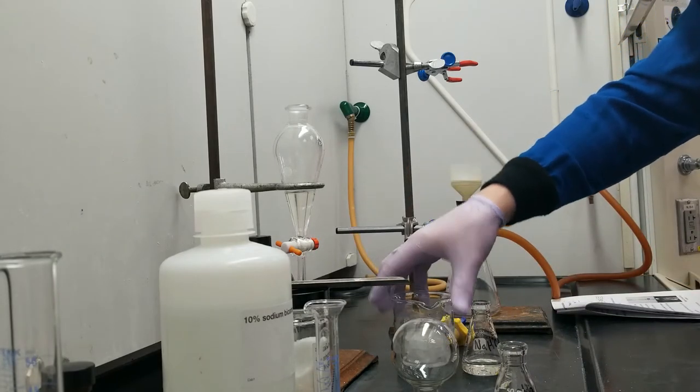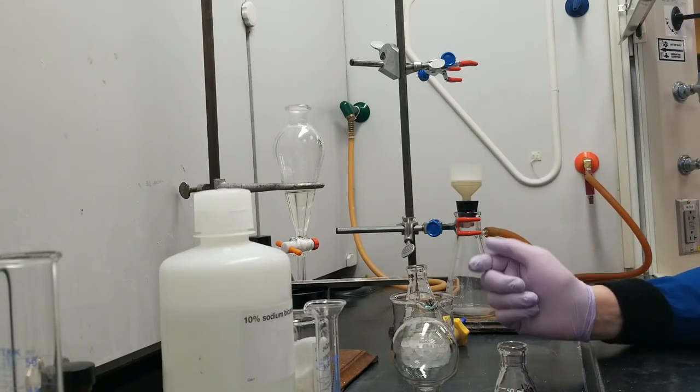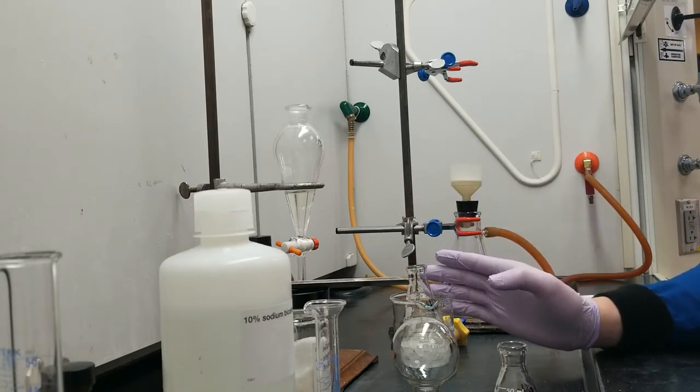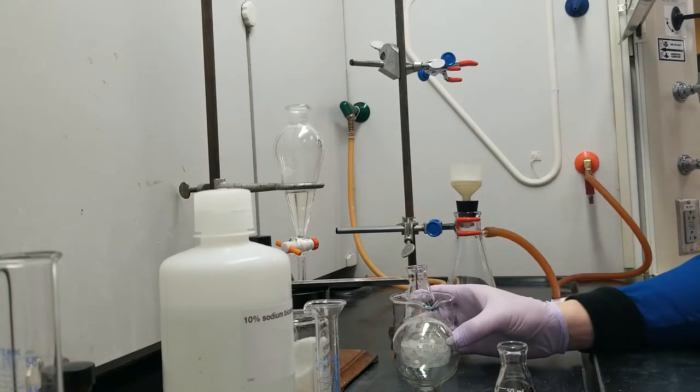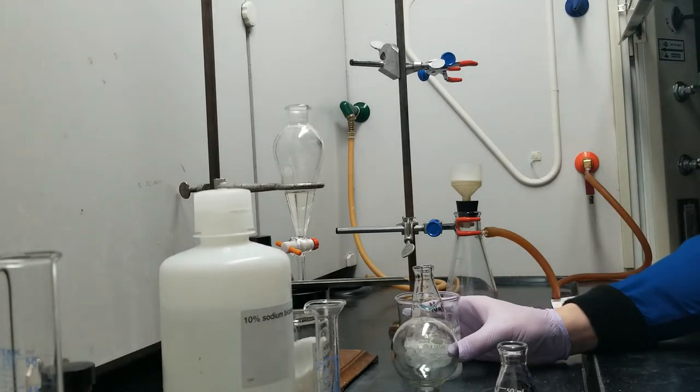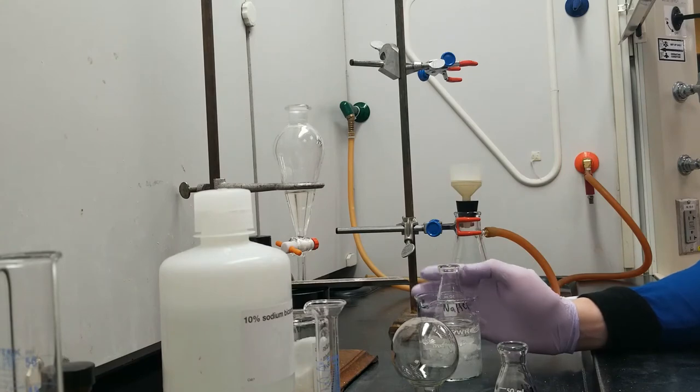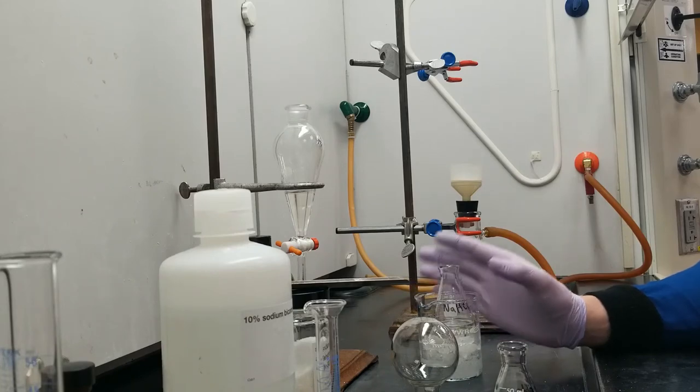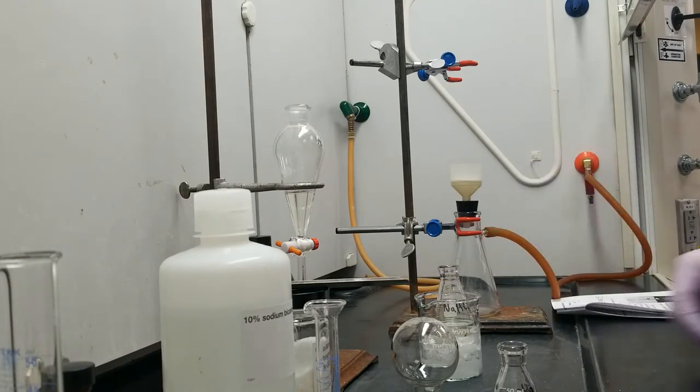So the way I want to do this is I would like to precipitate out my 3-chlorobenzoic acid by acidifying it, and then I'm going to collect it by vacuum filtration. When we re-acidify this, it's going to go from an ionic species, which is soluble in water, to a non-polar, protonated, uncharged 3-chlorobenzoic acid, which is going to be insoluble in water, so it's going to collect on itself and form solid.